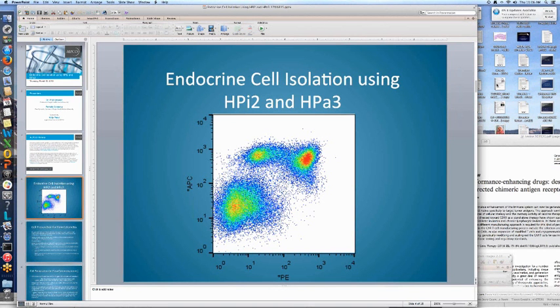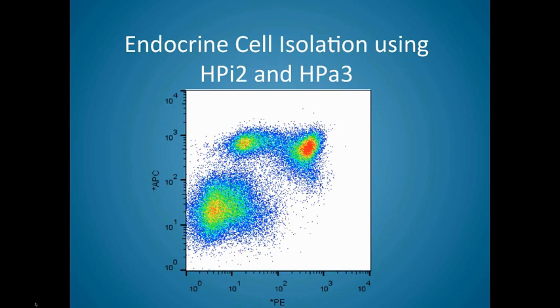Thank you very much for giving us the chance to describe some of these reagents today. The discussion will be divided into a couple parts. One where I'll start out by describing a couple of reagents and how we prepare cells for flow cytometry. And then Pam is our expert at sorting these cells and working with the antibodies that way. She probably has more experience than anyone else in the world, maybe, with sorting beta cells. So we're really excited to have the opportunity to share this with you today.